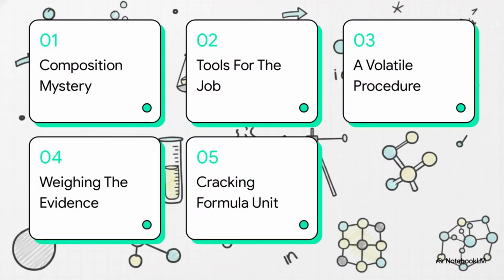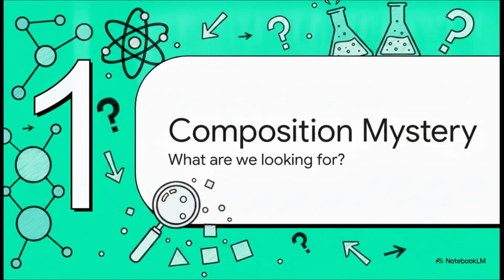Here's our roadmap for today. We'll start with the chemical composition mystery, get our tools for the job, run through a pretty volatile procedure, weigh the evidence, and finally, crack that formula unit. All right, Section 1, the chemical composition mystery.